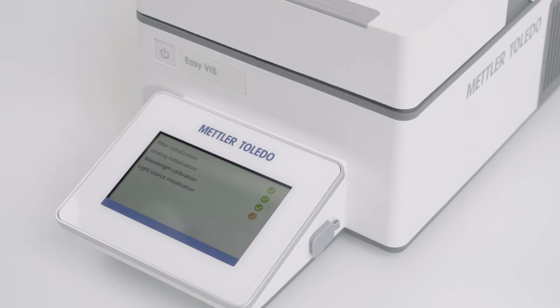In this video, you will learn how easily the lamp can be replaced on the EasyVis spectrophotometer from Mettler Toledo.